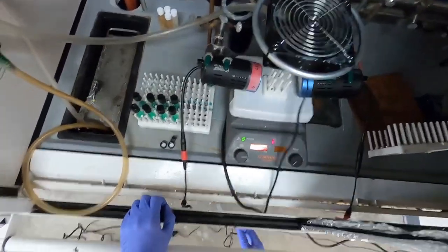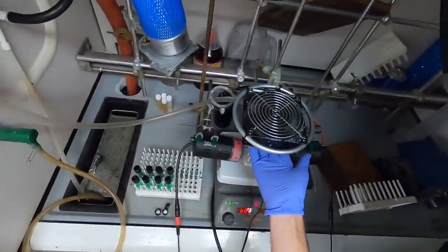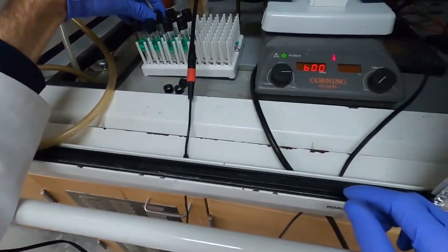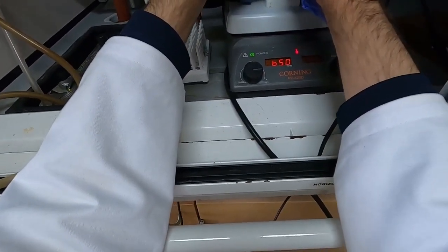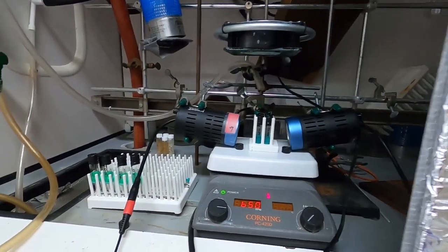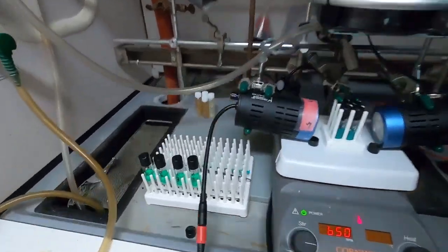I've got a fan here, so I'm actually going to turn that on now. Just plug that in. It's pretty strong. And before we turn the lights on, I'll put the reactions in here and make sure that the stirring is going well. Okay, everything's looking good. And we'll turn the light on.